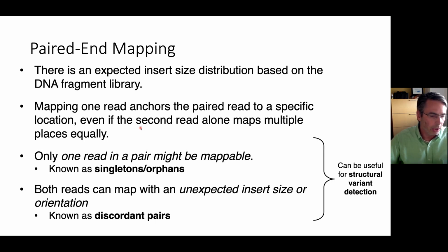That's kind of weird when I've got more or less uniform coverage everywhere else. And then you go into this bin of unmapped reads, okay? And you can take those out and use more specialized tools or pull that chunk of the genome out.